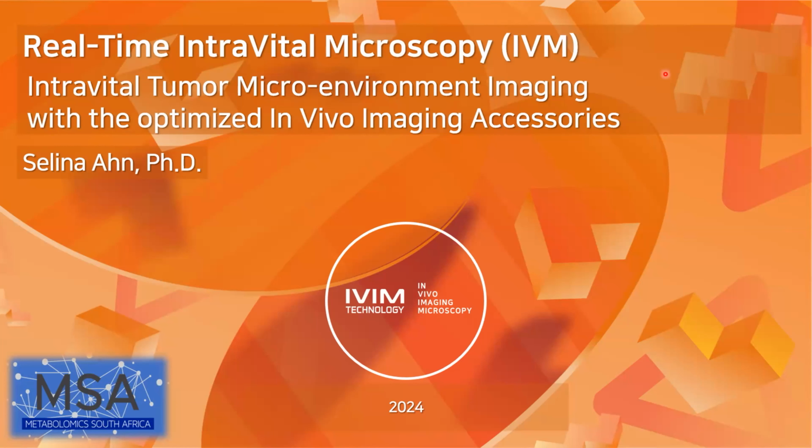But the main purpose is for in vivo real-time imaging and animal models to mimic human response to treatment, pathophysiology, etc., at a cellular level, especially in cancer research. I know at Northwestern University we're doing some cancer research. So anyone else out there in Africa doing cancer research, this is a good technology to look into. The technology will also work for ex vivo studies involving cell culturing, another good application.